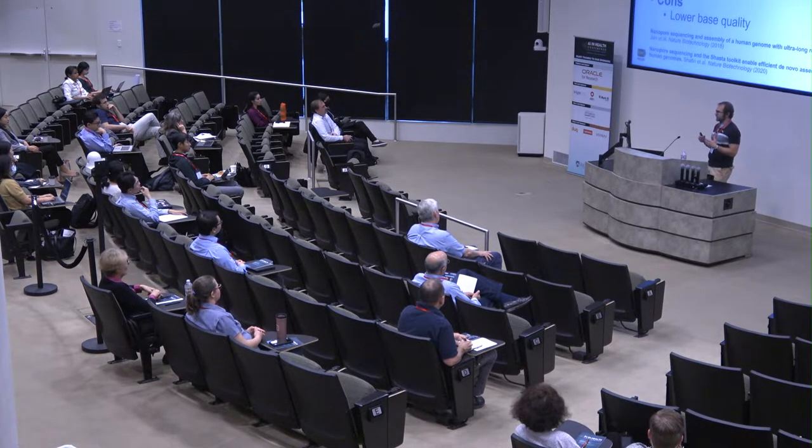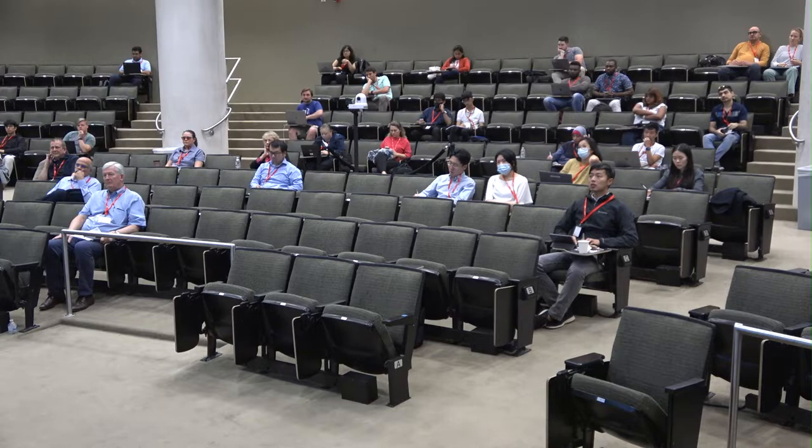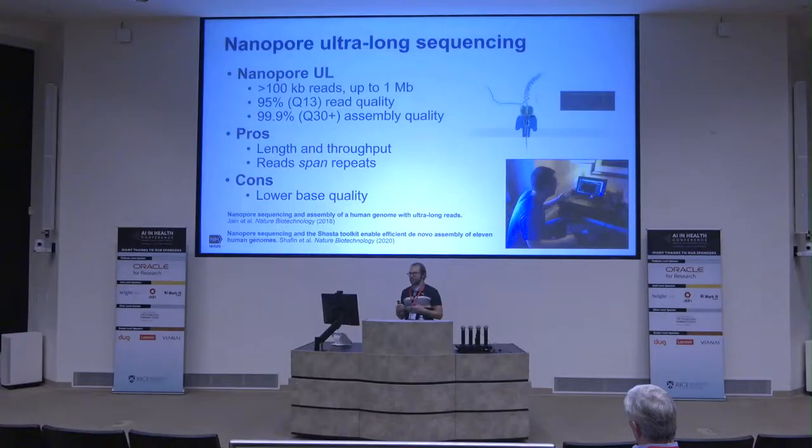Obviously, because you're reading a single molecule strand, the accuracy is not as high as what you may have been used to from the Illumina sequencing instruments. That's 95% or so, though it's always improving as they use more sophisticated machine learning algorithms and get a better understanding of what features of the DNA impact the current. For example, methylated bases affect it differently than non-methylated bases. The more you learn, the more you see, the better your models get. They've recently even demonstrated reads with over 99% accuracy in some contexts. So the pros are extremely high length and very high throughput, because these instruments are tiny and you can run a lot of them in parallel, but there's relatively lower base quality.